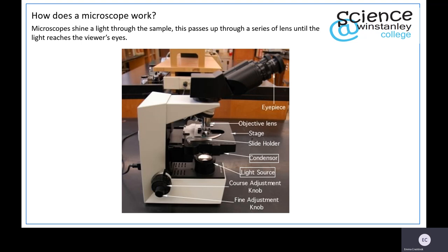Your sample or object is held on your stage by your slide holder, generally on a slide. The light passes through your condenser, through your sample and into your objective lens. The light then travels up where there is a mirror that bounces the light into the eyepiece lens, which is where you look through to see your object.